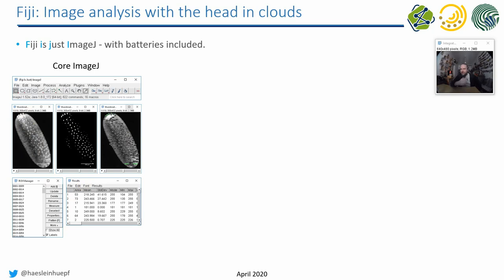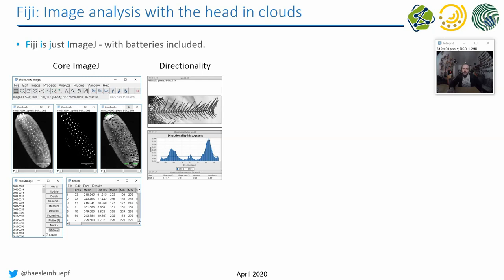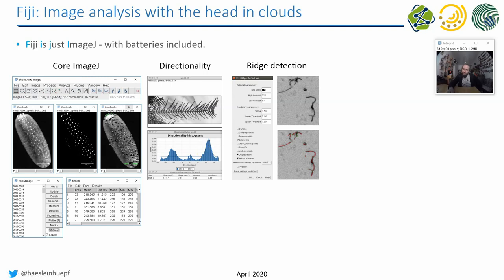This is Core ImageJ — this is the functionality ImageJ provides. And on top of this, there are hundreds of plugins for any kind of image analysis. For example, if you want to know in a particular image where there are lines in different directions, you can use the Directionality Plugin to measure the direction of objects in an image and draw a histogram of those directions.